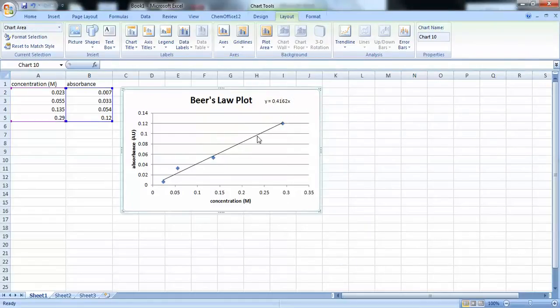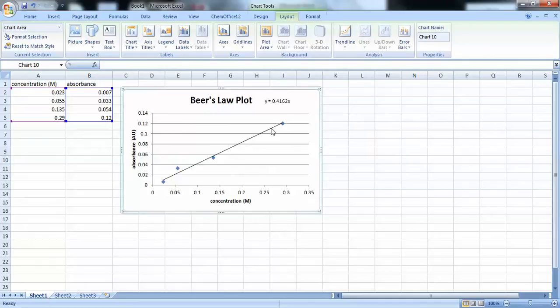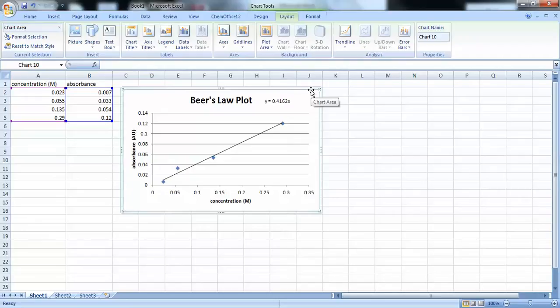This line happens to have a slope of 0.4162. And that slope is important because according to Beer's Law, the slope of the line is your extinction coefficient. And you'll be using that extinction coefficient to figure out the concentrations for the unknown samples.